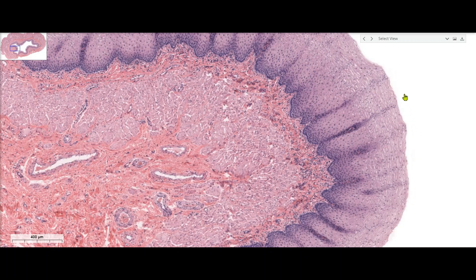There are no dead cells on top — there's not that keratinization that we see in the skin. Below our epithelial layer, we have a layer of loose connective tissue known as our lamina propria. The lamina propria essentially supports this epithelium. Below the lamina propria, the last sub-layer — this grayish pink layer — is called the muscularis mucosae. The muscularis mucosae is a thin layer of smooth muscle that helps with the passage of material inside the lumen and enhances the interaction between the epithelium and the things passing through the lumen.